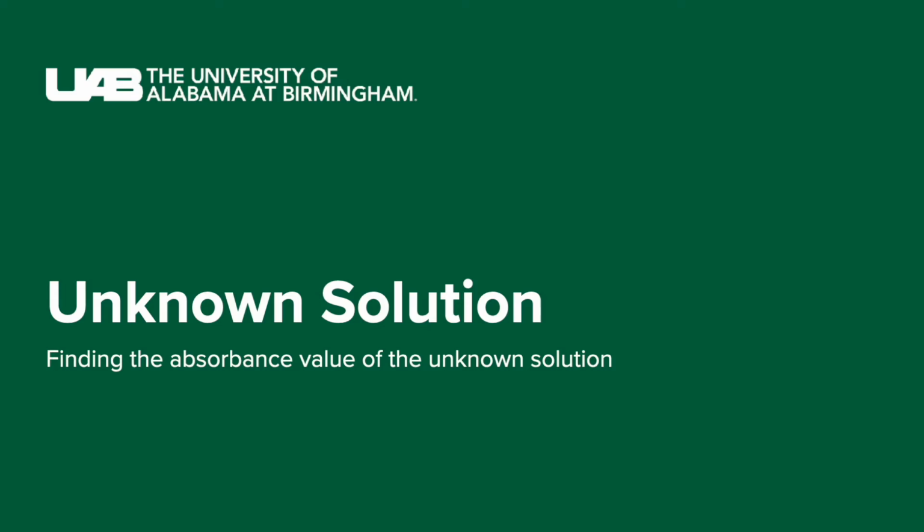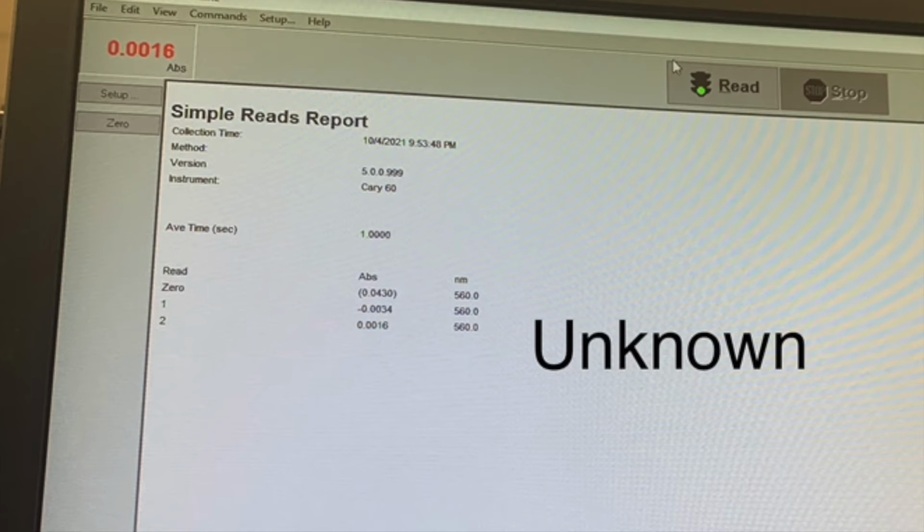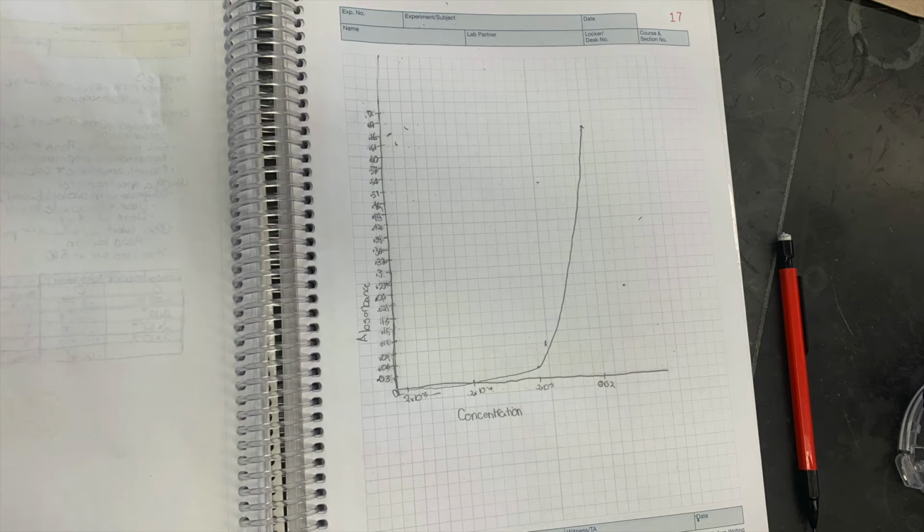Now we get the absorbance value of our unknown solution. We make sure we've zeroed the spectrophotometer and wiped the cuvette. Here's our absorbance values and our concentration versus absorbance graph.